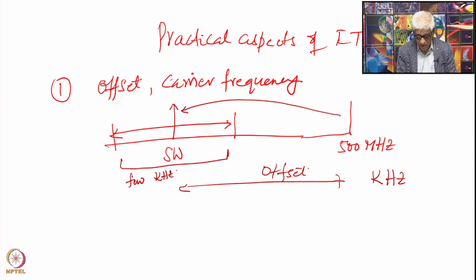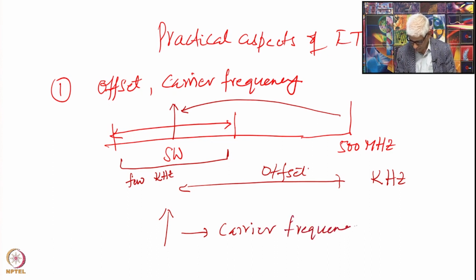Okay. So, when we do this, we achieve a uniform excitation of all your frequencies. Therefore, it is necessary to move the spectrometer frequency to this point. And then this frequency, what I put here, is called the carrier frequency. Spectrometer frequency is here, the main frequency, but when I shift it and bring it to the center of my region, or one end of the region or whatever, then it is called the carrier frequency, and the amount by which I shift is called the offset.